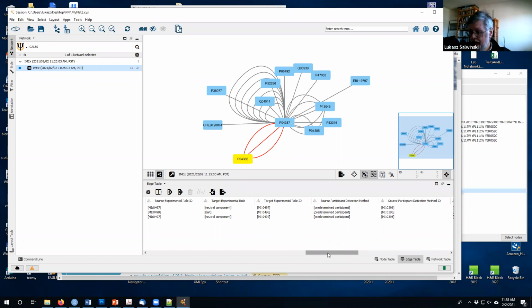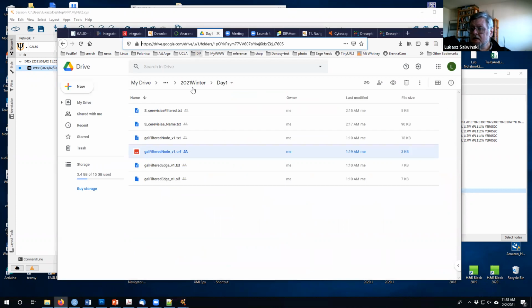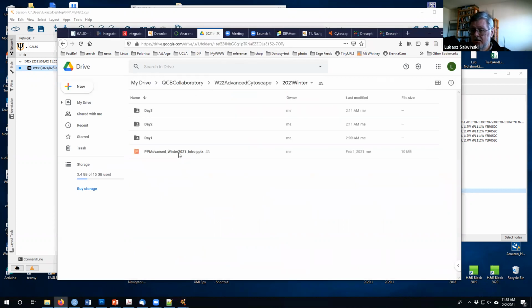probably it would be good if you read through this PowerPoint, click through the PowerPoint that I dropped in here. If you click through this thing, there's a brief outline and few examples of different methods that can be used to identify protein-protein interactions.